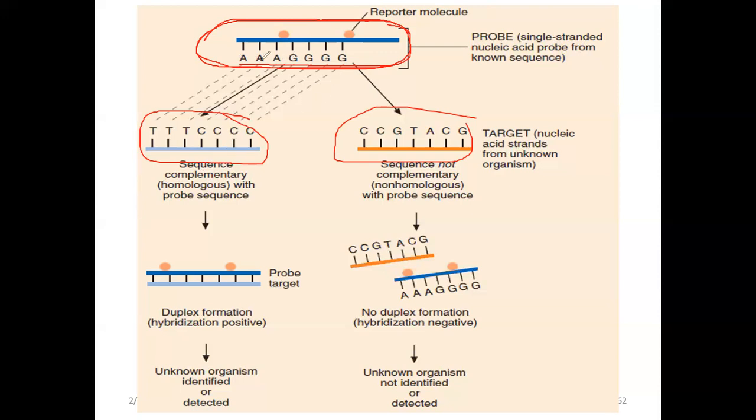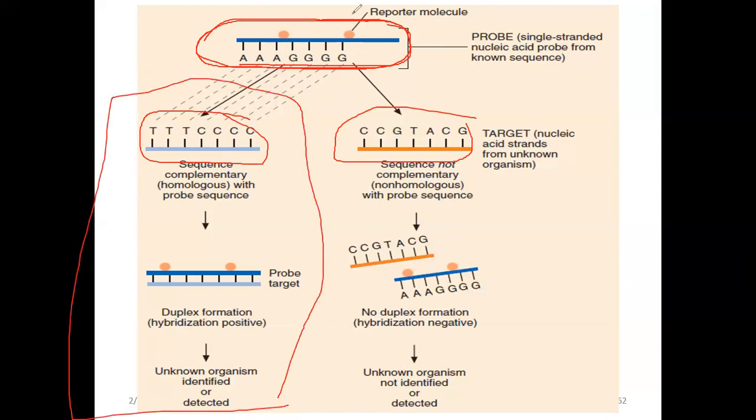So, after that, okay, this probe will be combined doon sa tissue. For example, ito yung first specimen natin. This one is our first specimen. Okay? If they're complementary, guys, magbabind sila. Complementary ba siya? A is to T. O yan. They're complementary. So, ngayon, what will happen? They will form a duplex.